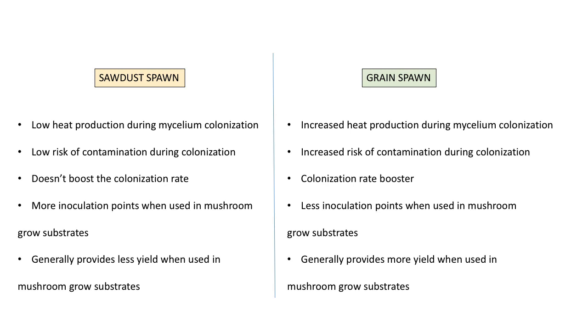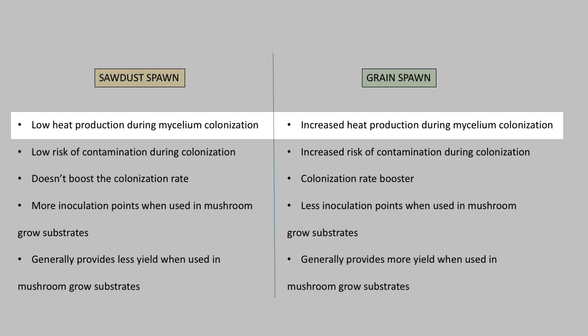So during incubation, mycelium inoculated grain bags produce heat. This is why you should always place freshly inoculated grain bags several inches apart, one from another. During this process, also a huge amount of CO2 is released from your bags. You may feel this heat by touching the grain bags after 7 or 10 days after inoculation.